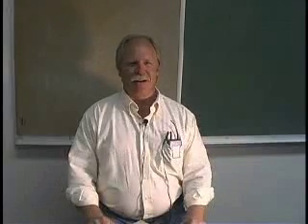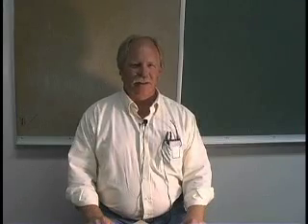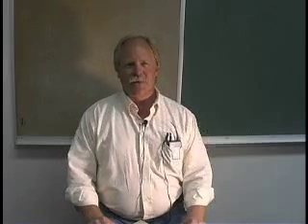Okay, my name is Mark Maggie and I am the District 6 Entomology Specialist from Fort Stockton, and today I'm going to demonstrate how to properly mount Lepidoptera.